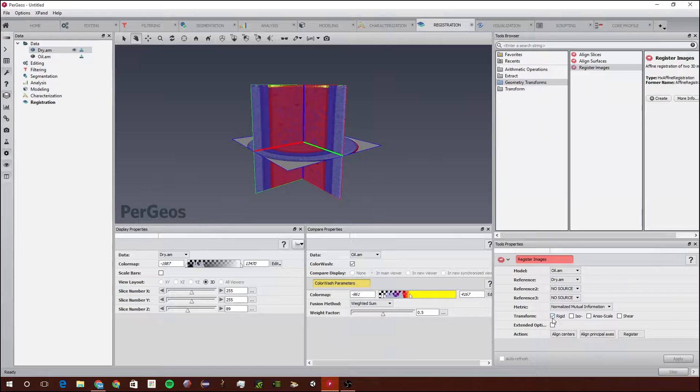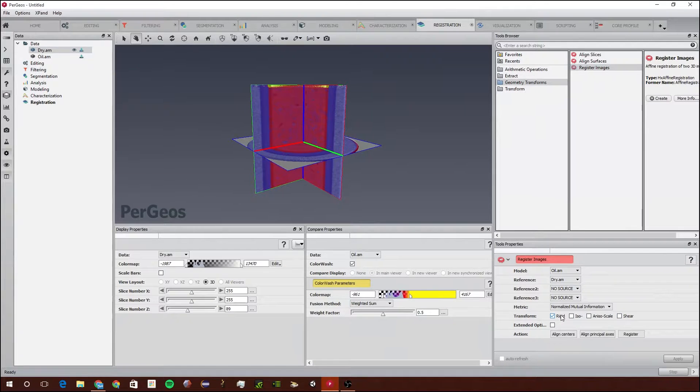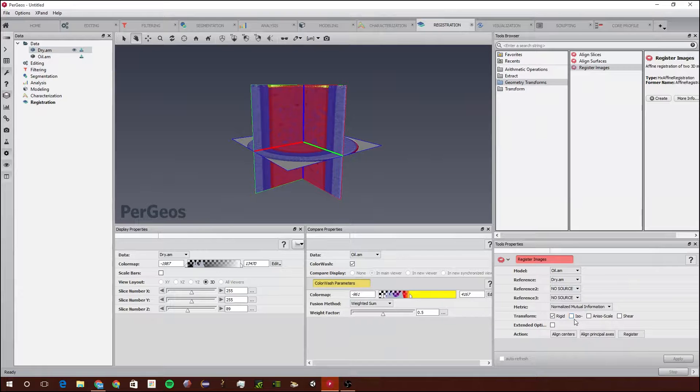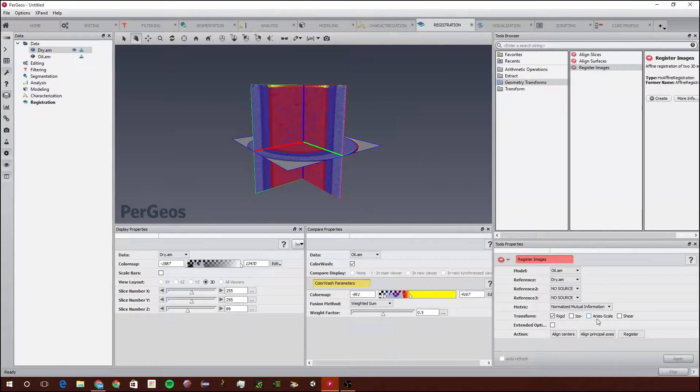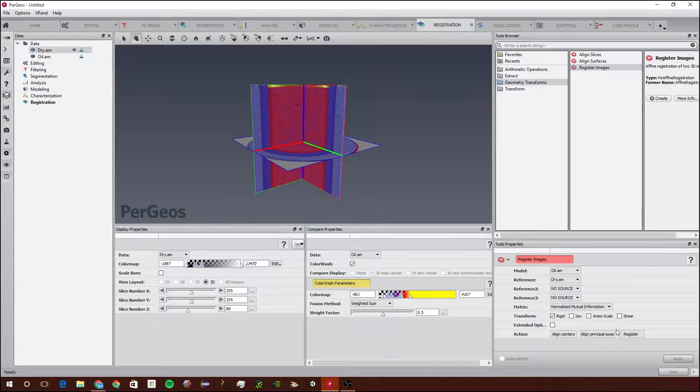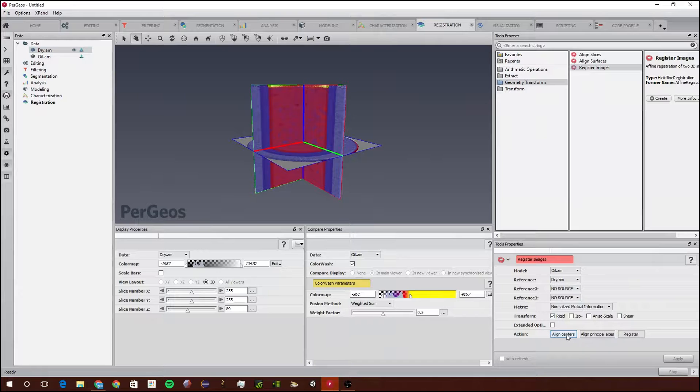Next we're going to need to decide how many axes we're going to transform it on. You can use Rigid which is 6 axes, Iso which is 7, Anso Scale which is 9, and Shear which is 12. We're just going to leave it on Rigid for this tutorial.